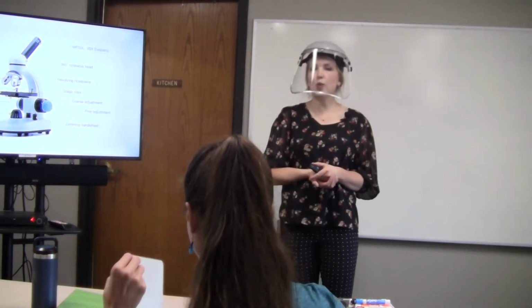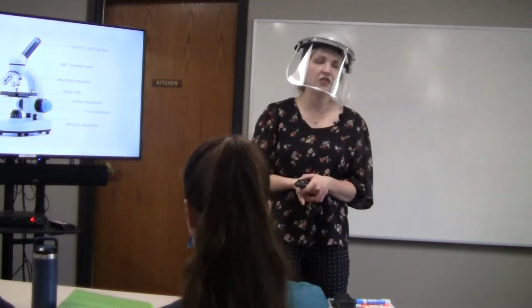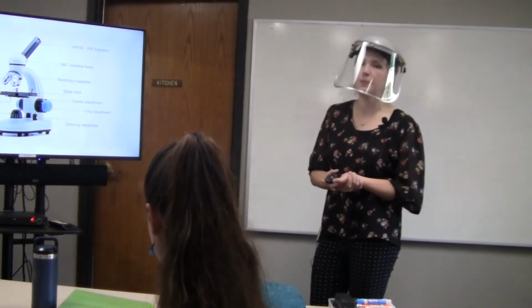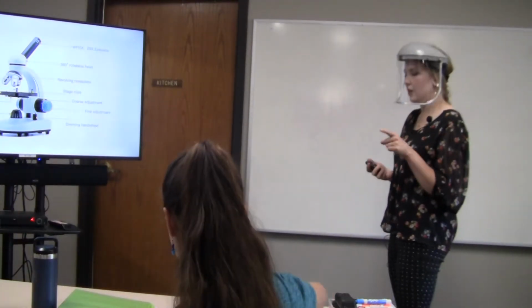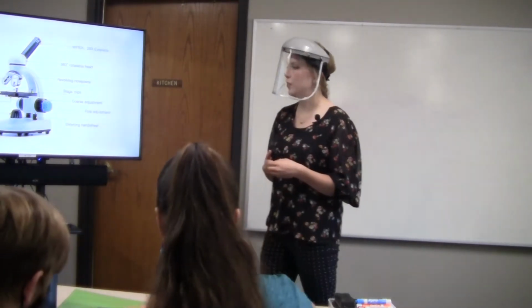Okay, so this is what most of our microscopes look like. These are very similar, with slight variations on this. There's different parts of a microscope, so we're going to define those parts here in just a minute. But let's first look at the microscope.